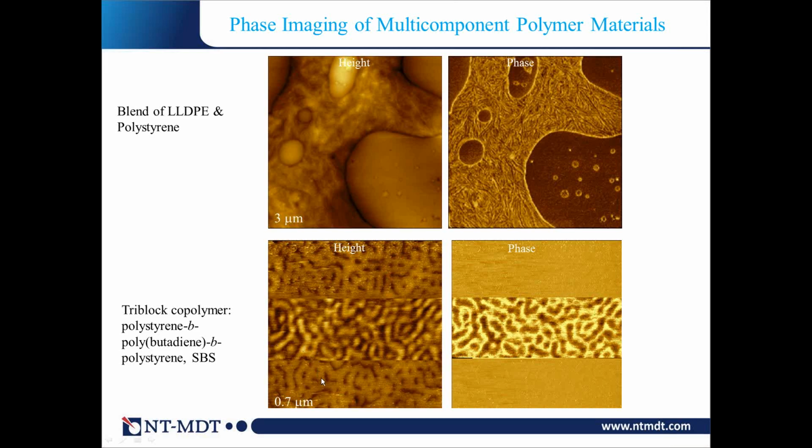Again, if you drop your force back, you see that the rubbery component is dominating the top layer, which means your tip deformations are not irreversible. The rubber recovers, and if you lower the force again, you see very nice topography without phase contrast. You can scan back and you see that place, if you haven't used much force, will completely recover. In some cases, if you've used excessive force, there will be some damaged area. That means you disturbed the surface layer.